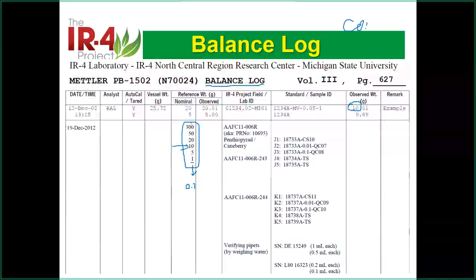You will make a copy, and you will stamp that as we just talked about. This is called a true copy or exact copy. We will do that, because the original logbook should go with the balance. Because the balance is part of the lab. It's not part of your study. So you only keep a true copy in your data package.